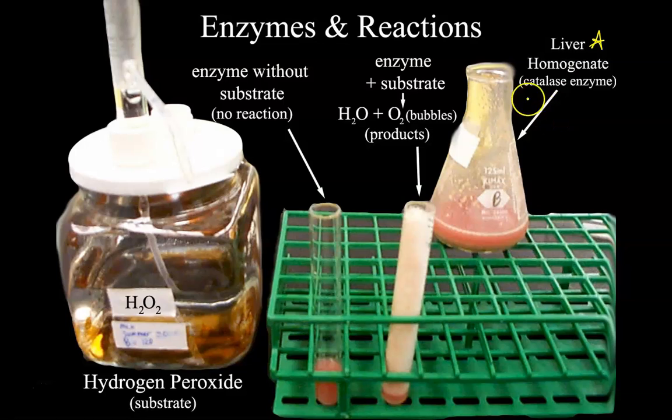liver. And you'll see that it says catalase enzyme. So we have some enzyme in here. On the left in this jar, we have some H2O2, which is hydrogen peroxide, which is our substrate. This is one of our reactants. You'll see that when we run the reaction on the left side, the enzyme without the substrate, we don't get a reaction. There's nothing happening. You can just see the liquid resting there at the bottom.